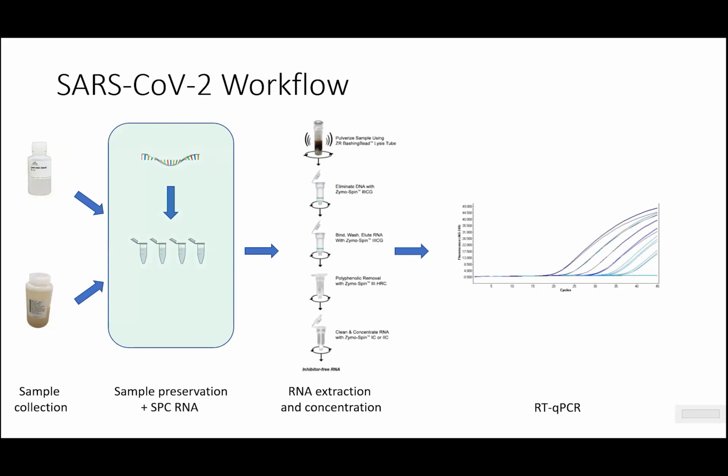Another critical component to any kind of quantification approach really involves assessing the recovery of the process. This is especially important when you're looking at wastewater, where you can have things in the matrix that can interfere. So without some metric of recovery, you're not going to know if the differences you see in the concentrations of the virus are due to processing issues or changes in the viral RNA in the wastewater itself.